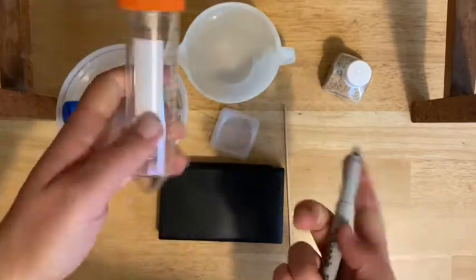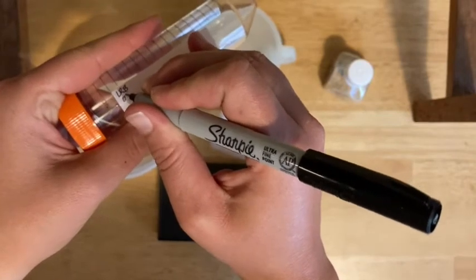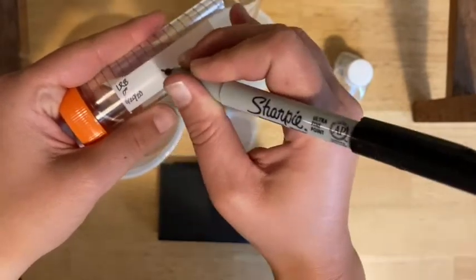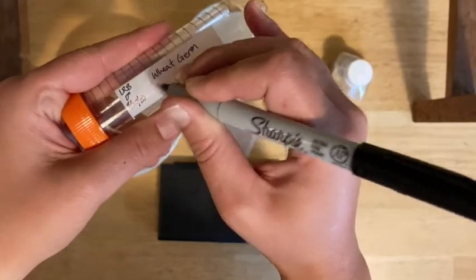The first thing you want to do is label your big tube. This is going to be your initials, your period, the date, and what's going to be in here. So this is wheat germ DNA extraction.